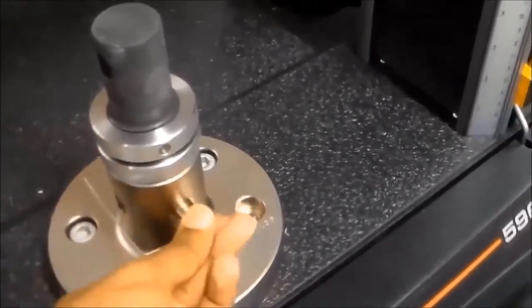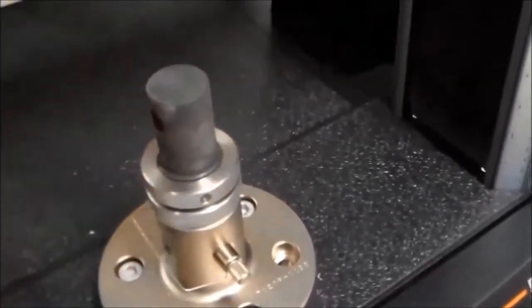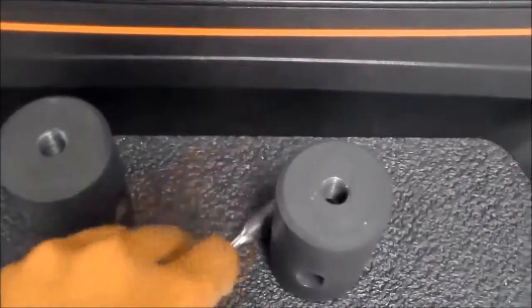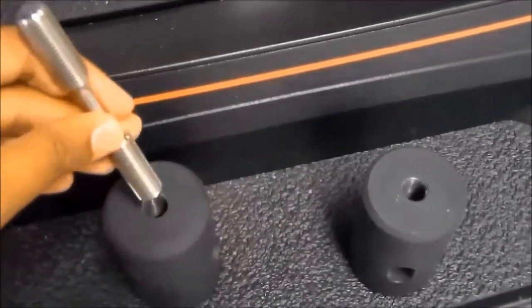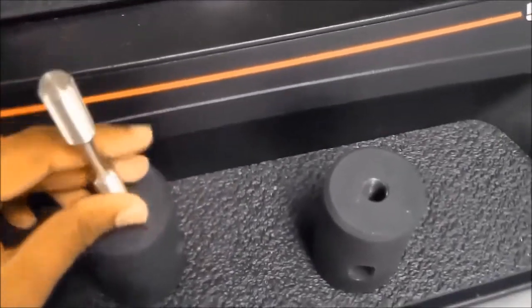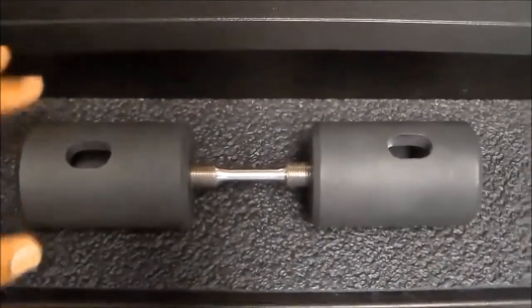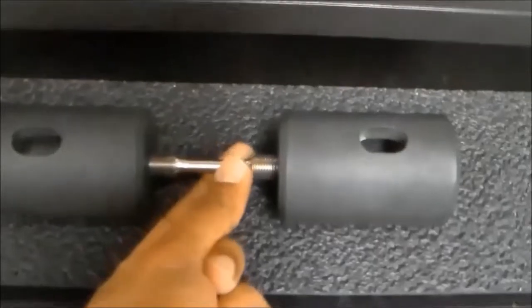Before we mount the grips on the system, we need to connect the testing specimen with the grips first. Here is the view showing both grips connected with the testing specimen.